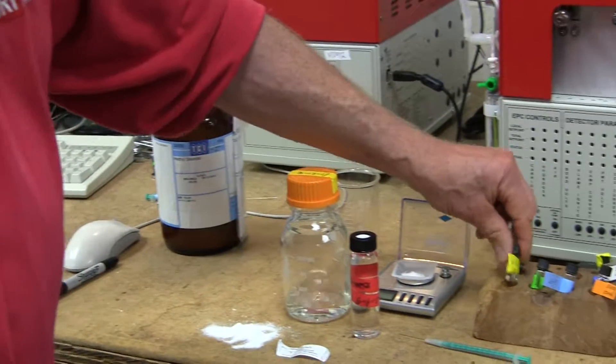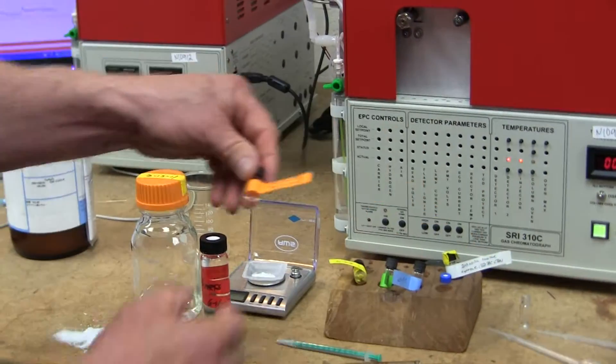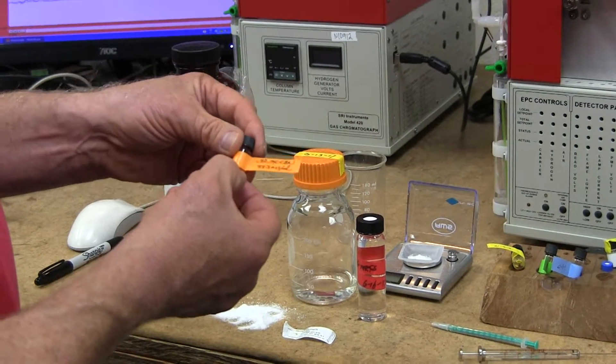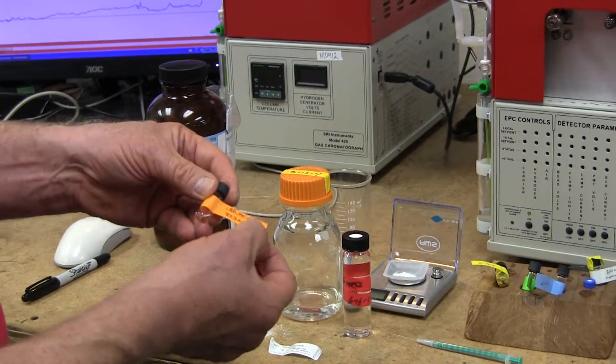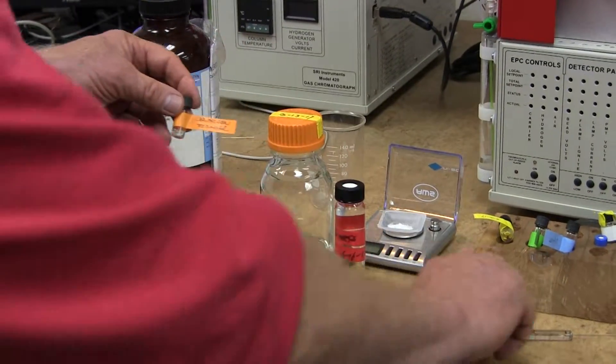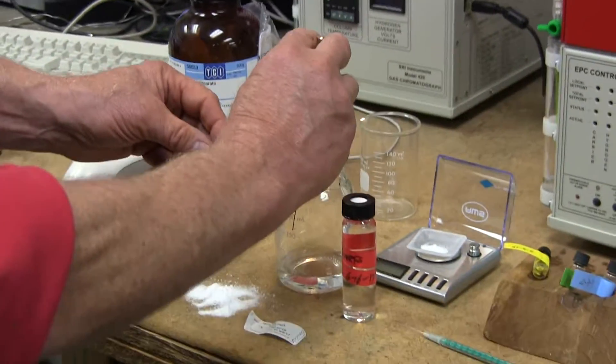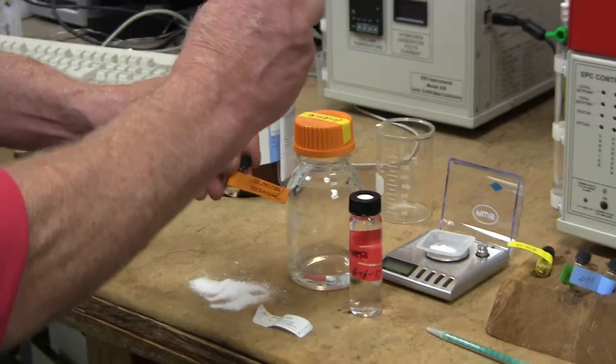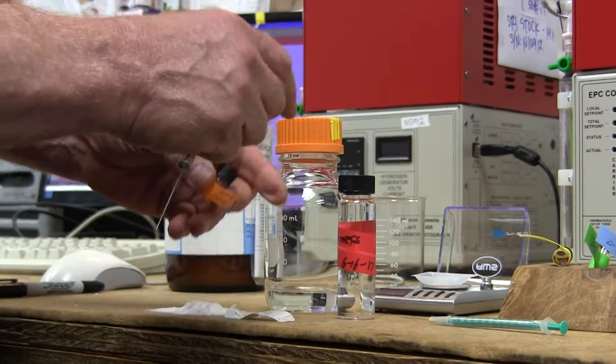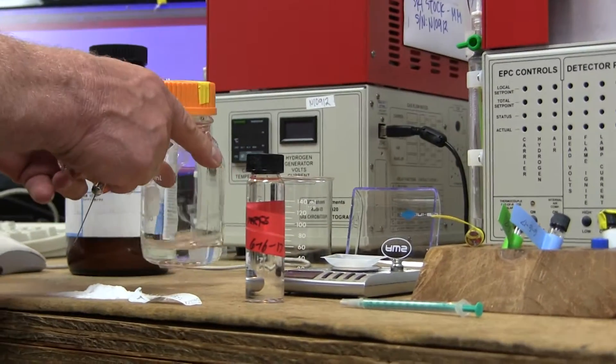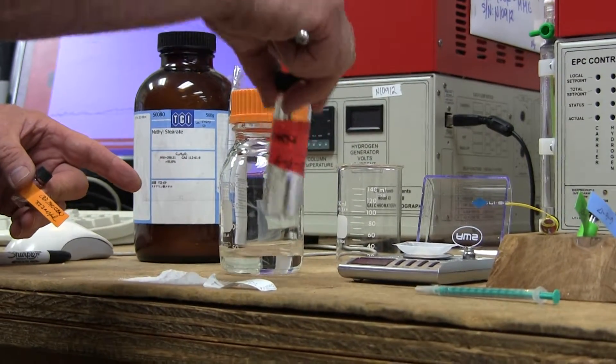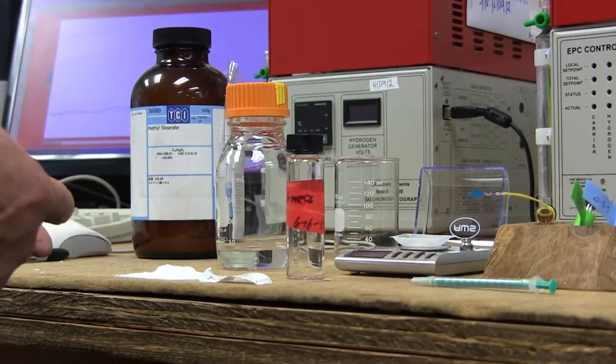Just a couple minutes ago, we were talking about how to make the external standard calibration into an internal standard calibration. The way we do that is by taking an equal amount of liquid out of the internal standard solution jar and putting it into the external standard. But instead of just using the plain internal standard solution, we're going to use the internal standard solution that we've added the terpenes to.